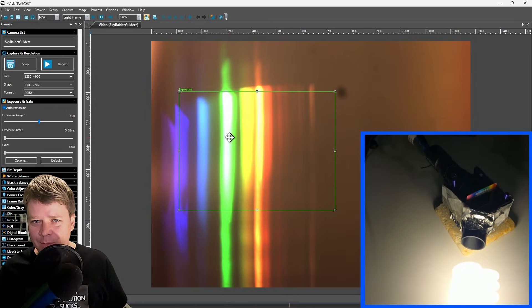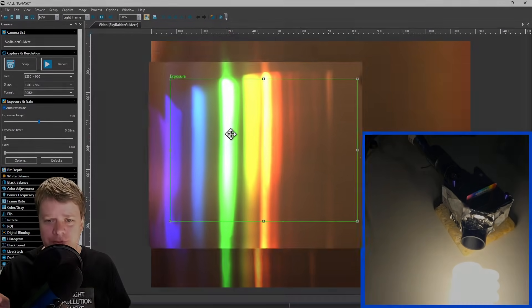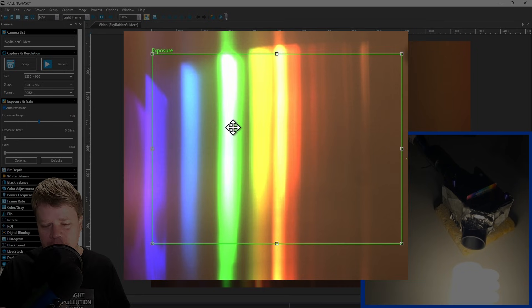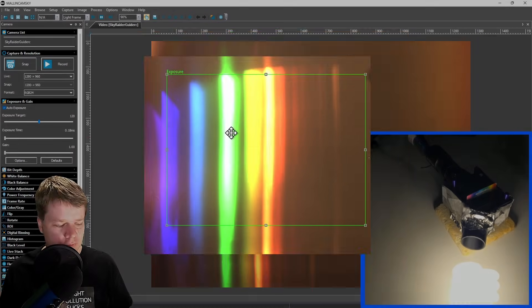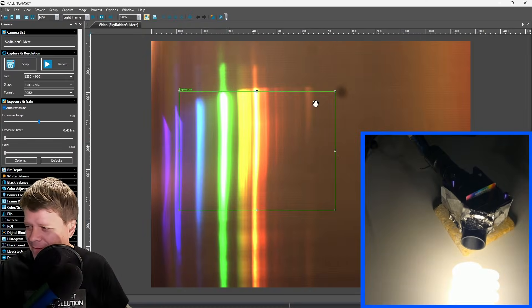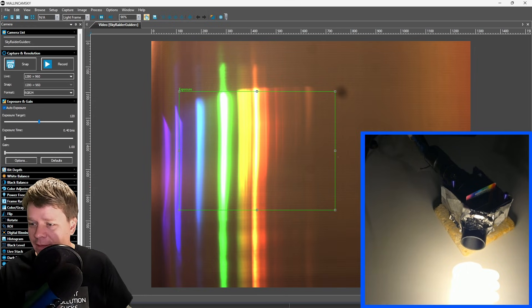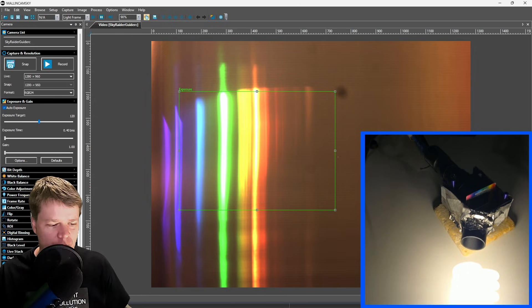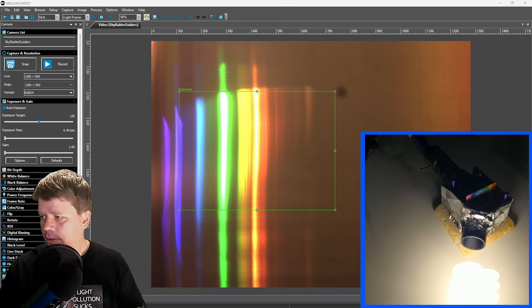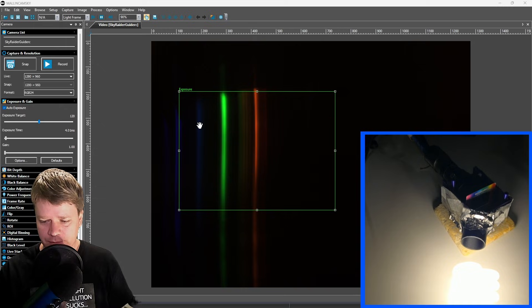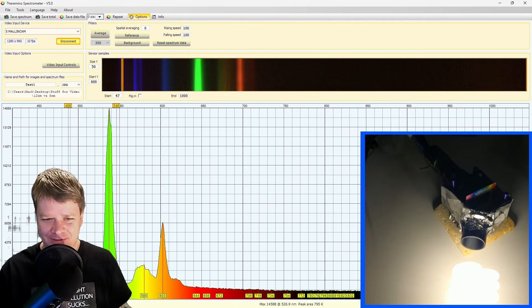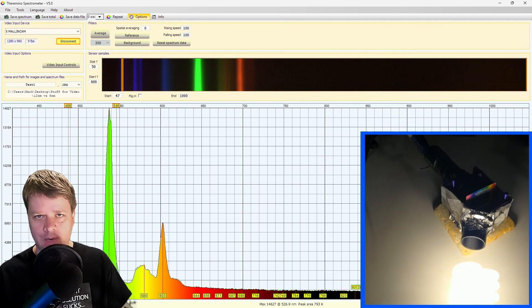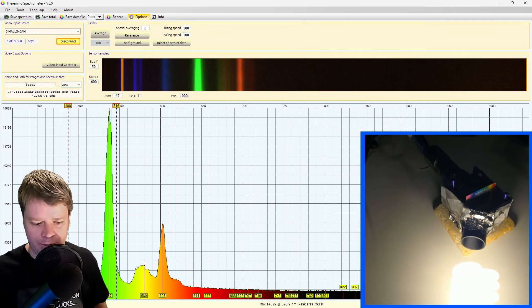So this is a color camera, which is nice, you can tell that the blues and the purples are on the left and the reds are on the right, which is what we want for the software. And there we go, we've got the spectrum showing up. So now let's go ahead and open up Theremino spectrometer. And we can go ahead and close this application. Let's go ahead and put the top back on and we will start to calibrate everything.